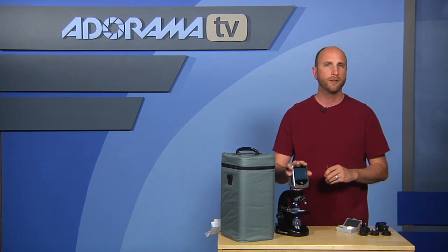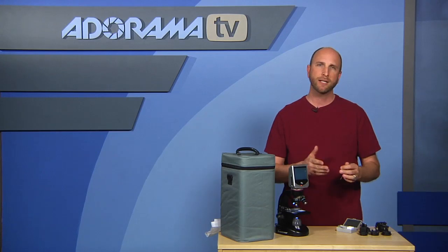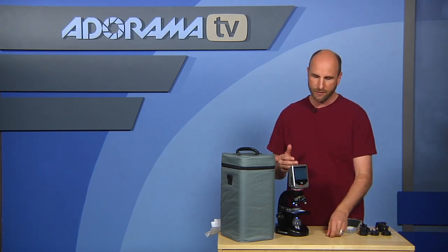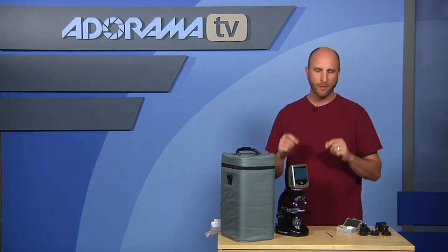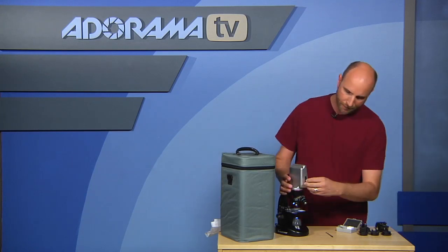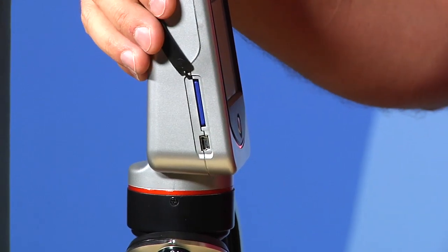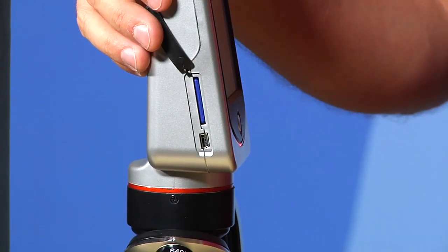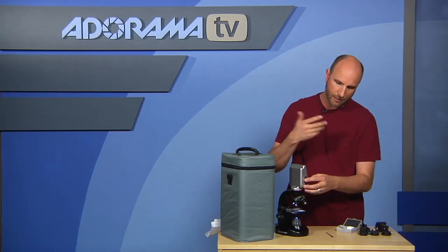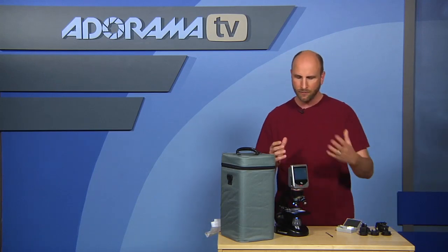This does not only still photos but also video. It is a five megapixel still camera, so 1600 by 1200 pixels. The nice thing is it has a one gigabyte internal memory card built in, so you can use that, or there's an SD card slot on the side so you can put in your own SD card and use however large a card you want. It also has a USB slot so you can connect it directly to a computer. Right out of the box you can start shooting and making photos.